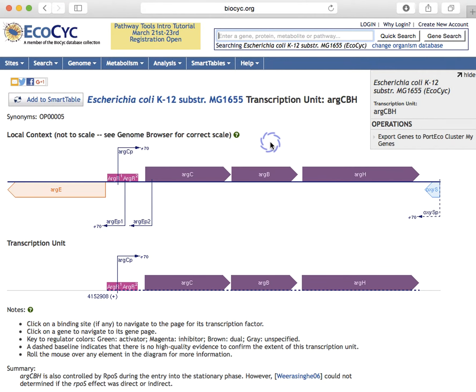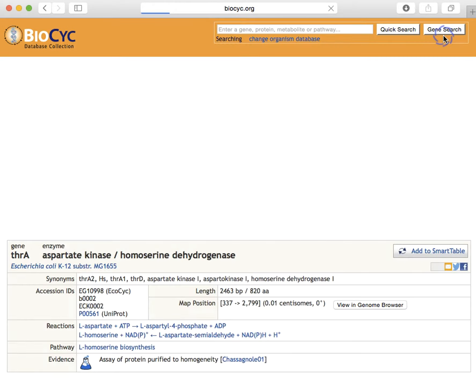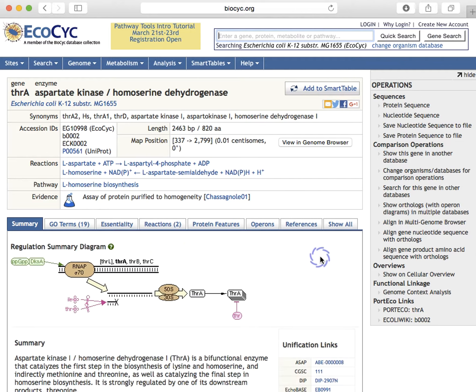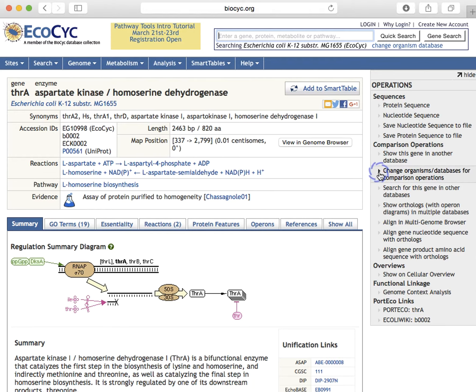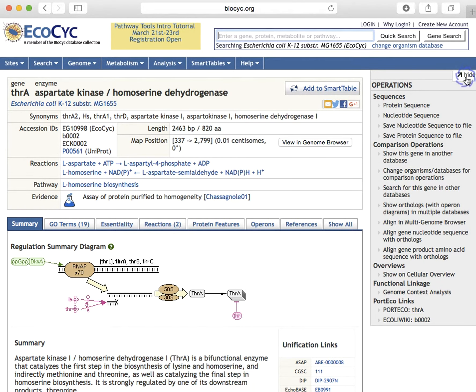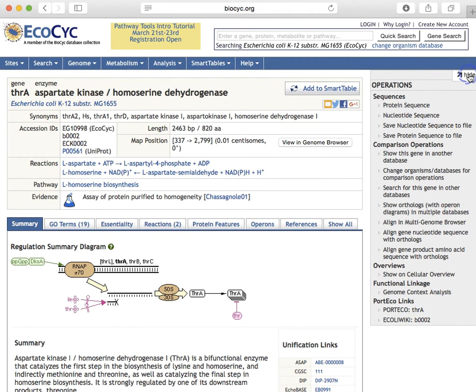Now we'll return to the THRA gene page to show you how to retrieve protein and nucleotide sequences. Commands for those operations are found on the right sidebar operations menu. And in general, the commands in this right sidebar menu change depending on what type of page you're looking at. For example, they will differ for gene pages versus metabolite pages, and we can hide the menu when we don't really need it when it's obscuring the view, and then bring it back.